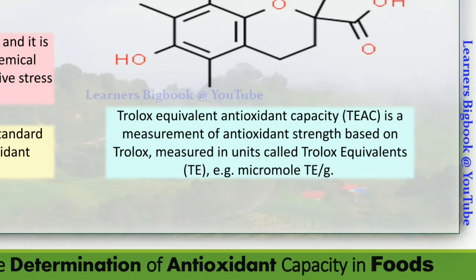They consider those values in the graph standards of the Trolox, and wherever the calculated value gets suited on the graph, it is called the value equivalent to the Trolox. So that is the Trolox equivalent, which we can consider as Trolox equivalent per gram or Trolox equivalent per ml.